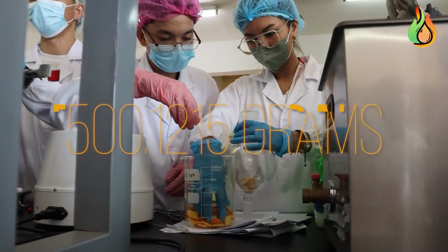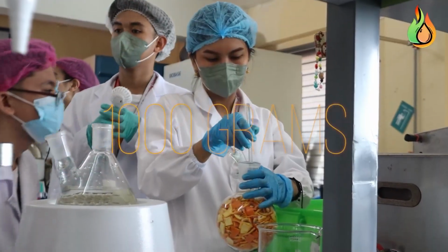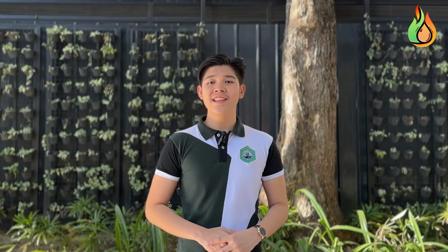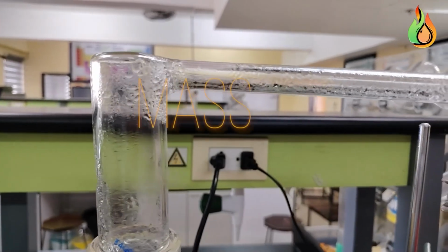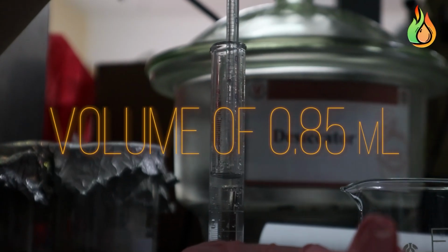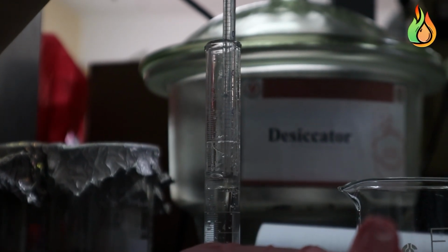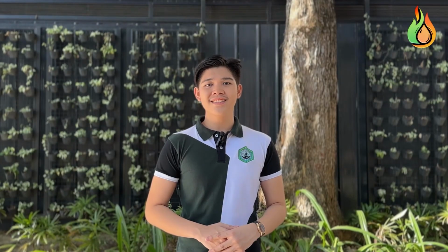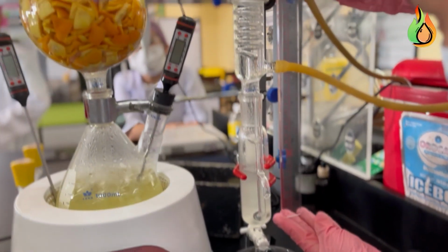To extract the essential oil from raw citrus peels, 500 grams of orange peels were combined with 1,000 grams of water in a distillation flask. As the mixture was heated, the aromatic compounds slowly condensed, yielding a mass of 0.6192 grams and a volume of 0.85 milliliters of pure citrus essential oil, a small yet potent essence captured from the peel. Yet, every extraction leaves a story of transformation.